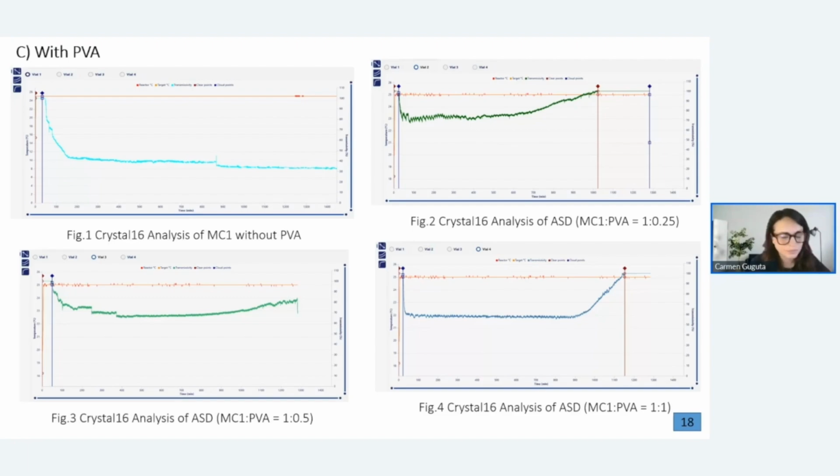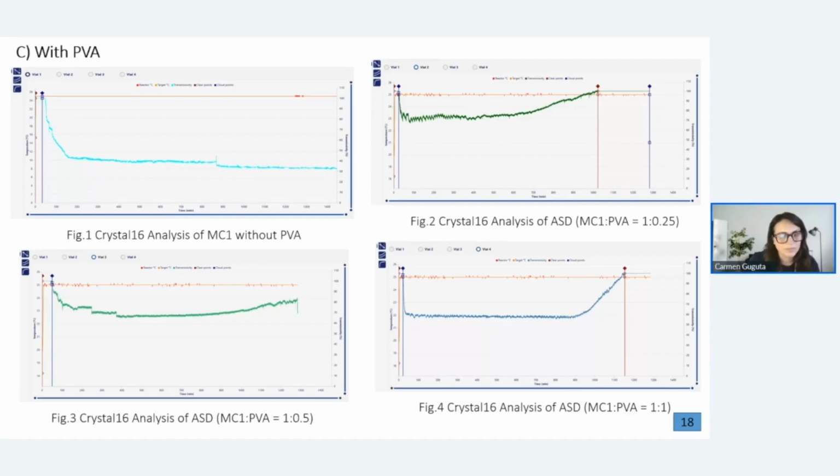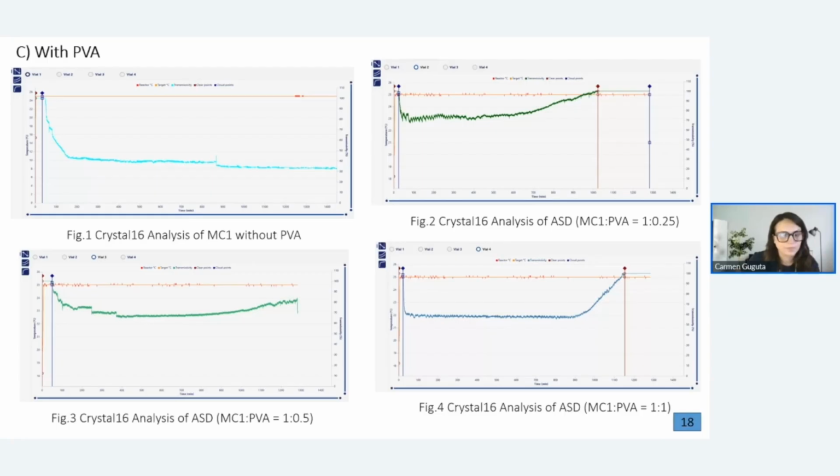Yeah, so the main reason was that these are the main physiological pHs at which the solubilities are looked at for ASDs. These are very restrictive buffers, right? Because under the full analysis, we have to look at different pH buffer medias. What we have presented today is only pH 1.2 and 6.8, but it can be done and has been done for other pH conditions also. This buffer simulates the gastric conditions in our body, so that's why these buffers were utilized.